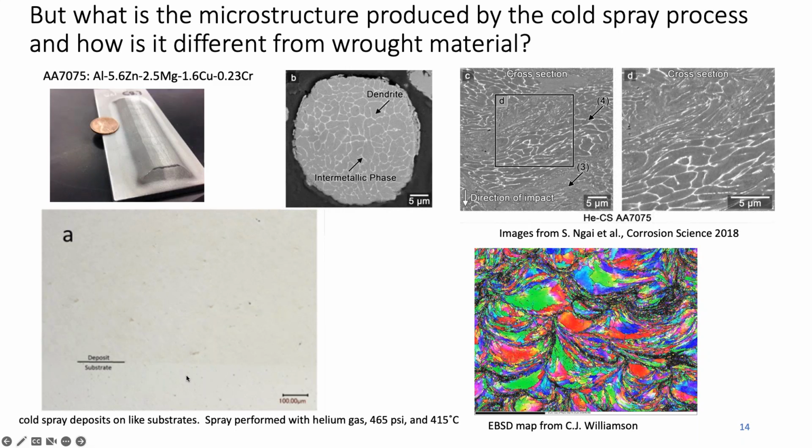You get some pitting when you polish these samples due to corrosion of intermetallics. But the bond line is almost perfect. We've got better than 99.5% density here. So the process can make excellent material, but has a very complex microstructure.